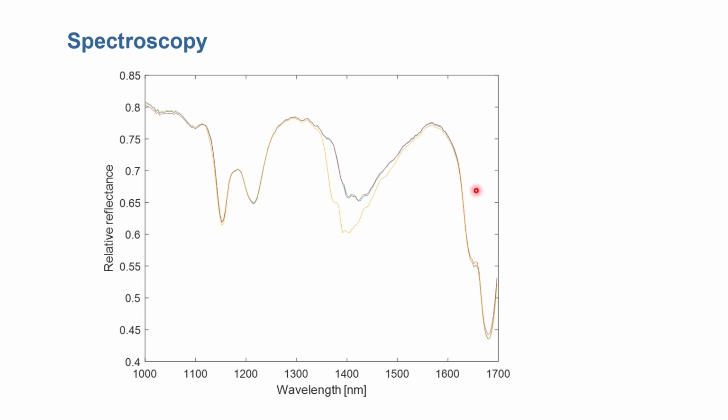The way we can have this distribution is that we are using instrumentation that can divide the measurement into a series of spectral channels. One spectral channel is very narrow, representing just a few nanometers, which means that the range of light here will be represented by hundreds of these spectral channels. The diagram by itself, showing this kind of spectral profile for a material, is what we call spectroscopy, the method of spectroscopy.